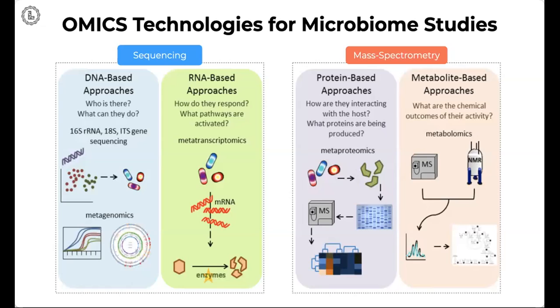While the 16S ribosomal RNA approach will help us place these microbes into known categories or taxonomies, the whole metagenomics approach will help us not just place them into known categories, but also identify and characterize some new members which were not characterized earlier.